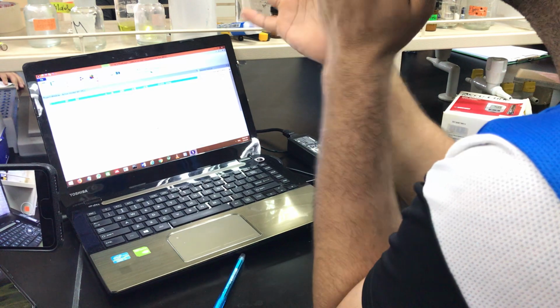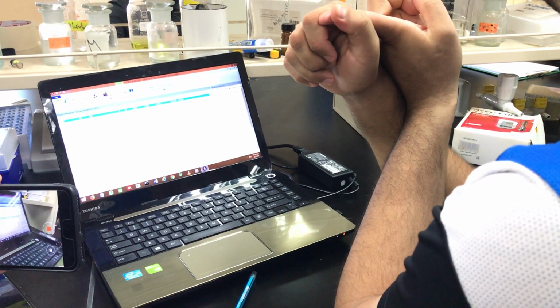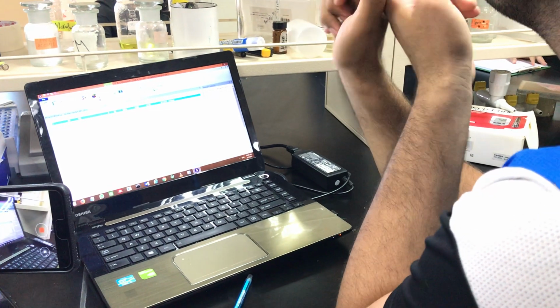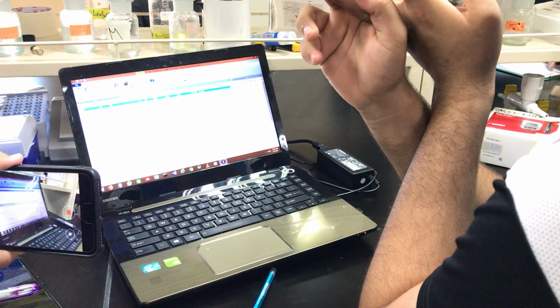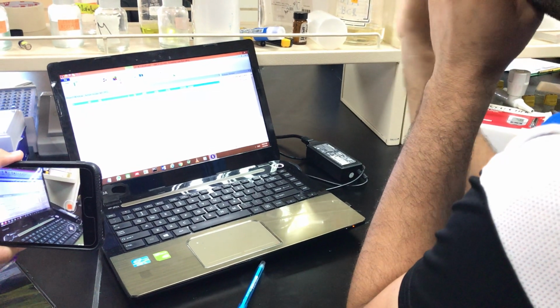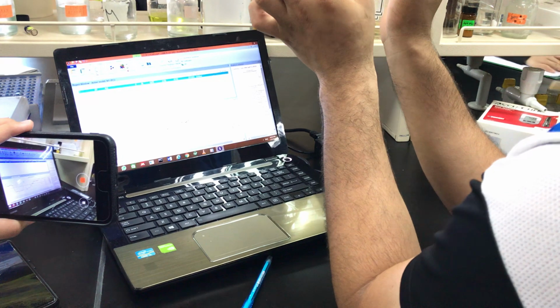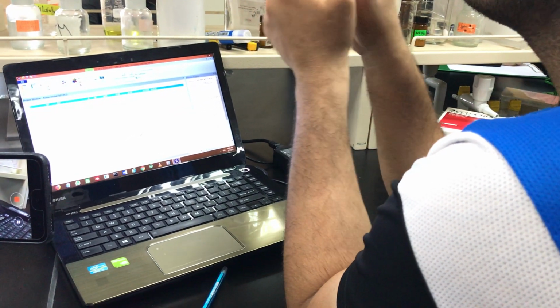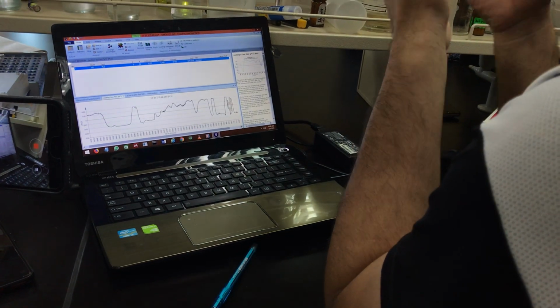There is no significant difference. This is the first reason. That's why the software didn't detect the difference in components. If you see the model is not valid, why? Because it's all active.